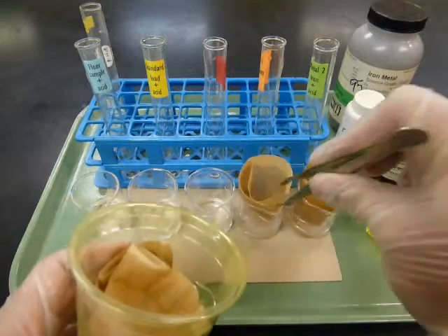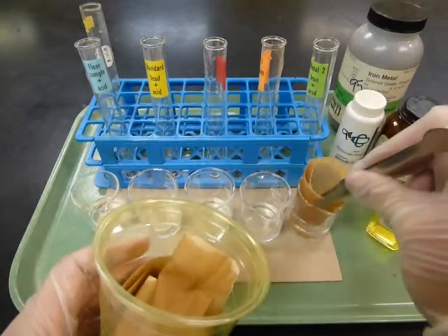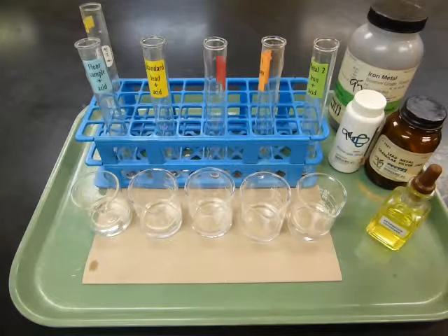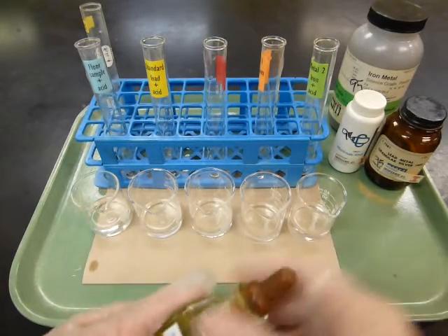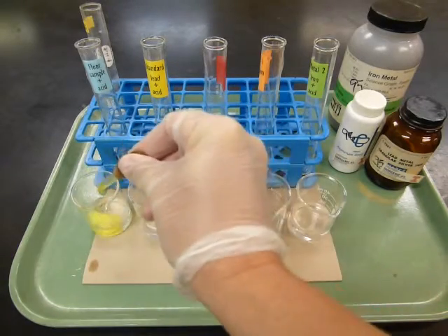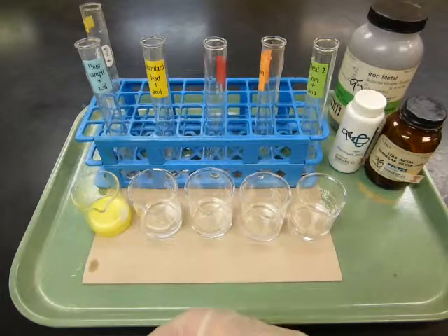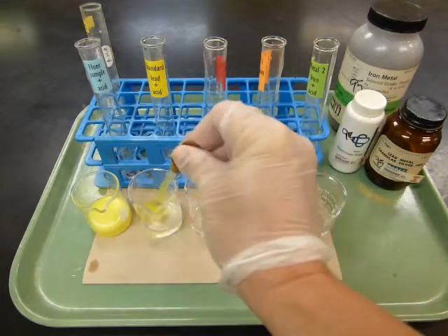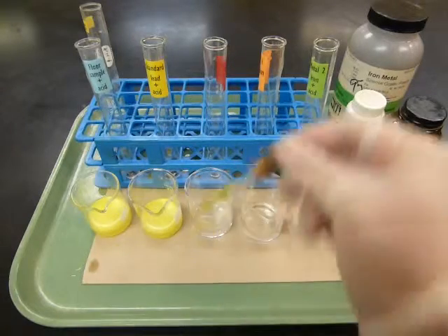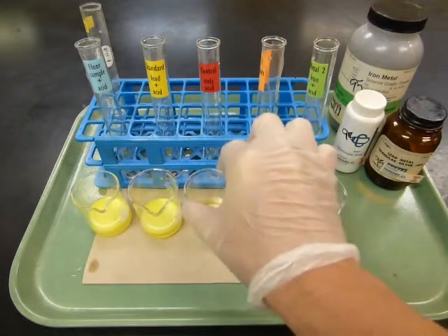You should already have predictions made for each one of these samples, and then we'll record our observations below the predictions to see how they compare. Okay, adding the chromate. So starting with the floor sample, it turns very cloudy, which is the result that was obtained the first time. And the standard, okay, that one turns very cloudy as well. The control, there's no reaction here on the control.